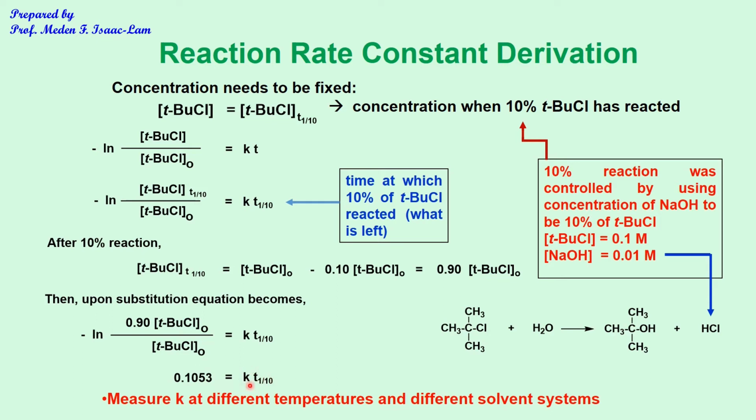In the experiment, we have 3 different times corresponding to 3 different solvent polarities. Because we will have 4 different temperatures of water baths, we can now determine or measure the effect of solvent polarity and the temperature on the reaction rate.